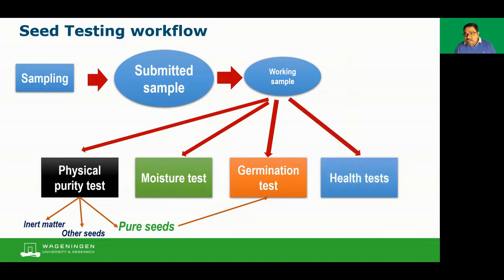And then the health tests are there. You can perform many health tests, normally cold tests, but health testing requires quite a high amount of expertise, as well as equipment like microscopes, media preparation, and ultraviolet light, so that you can incubate the seeds and so on. The seed health tests are very important, because they can show whether there are any kinds of seed-borne diseases inside the seeds, and what the microbial flora of the seeds is. There may be some saprophytic fungi or other fungi which may or may not be harmful. At least we'll get a health report of that.